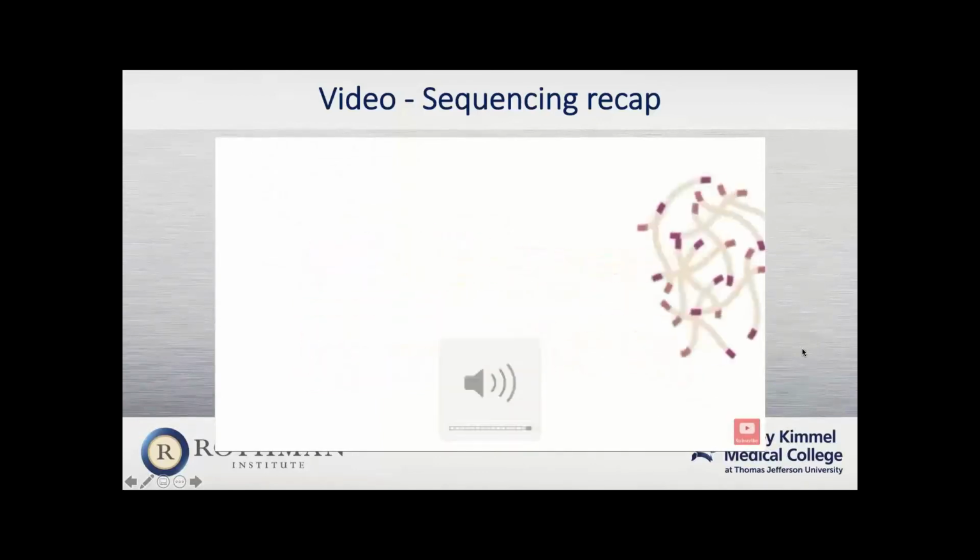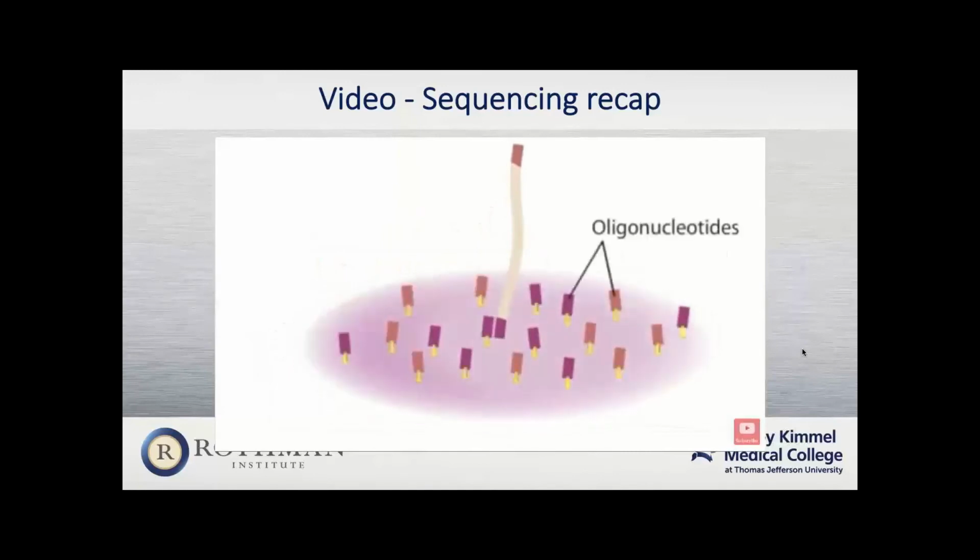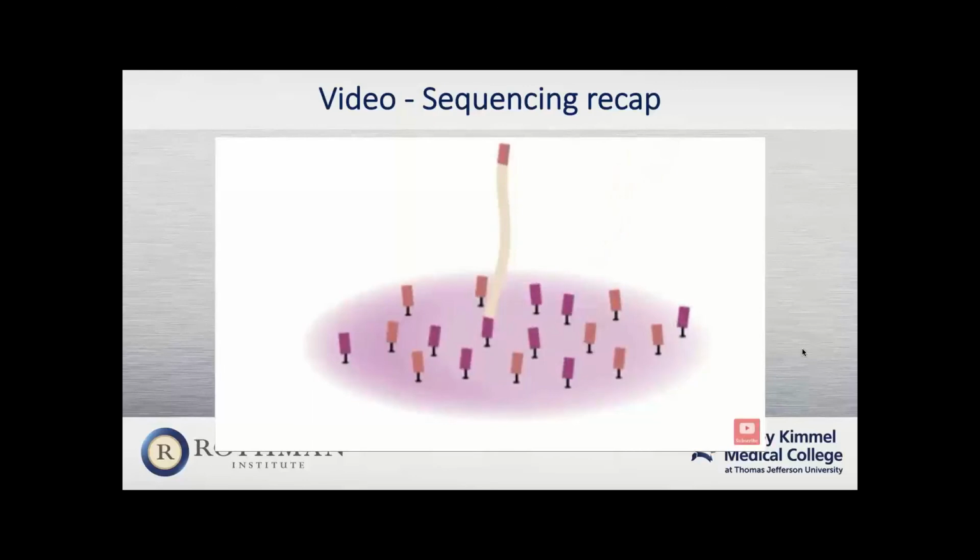Into single strands, and then captured on a solid surface. The attachment occurs through complementary base pairing with oligonucleotides that are fixed to the surface. In the next step, PCR, DNA polymerase synthesizes a second strand of DNA, starting from the annealed oligonucleotide, which serves as a primer. The two long strands are now separated, leaving one strand attached by a covalent bond to a fixed oligonucleotide.